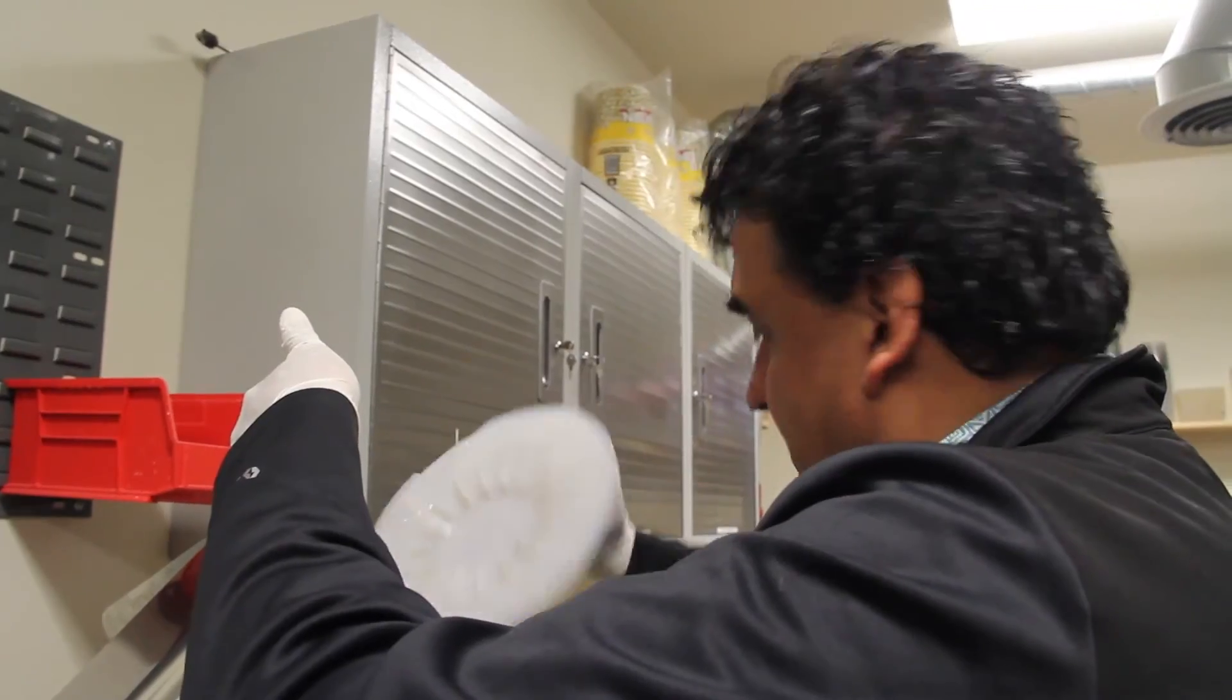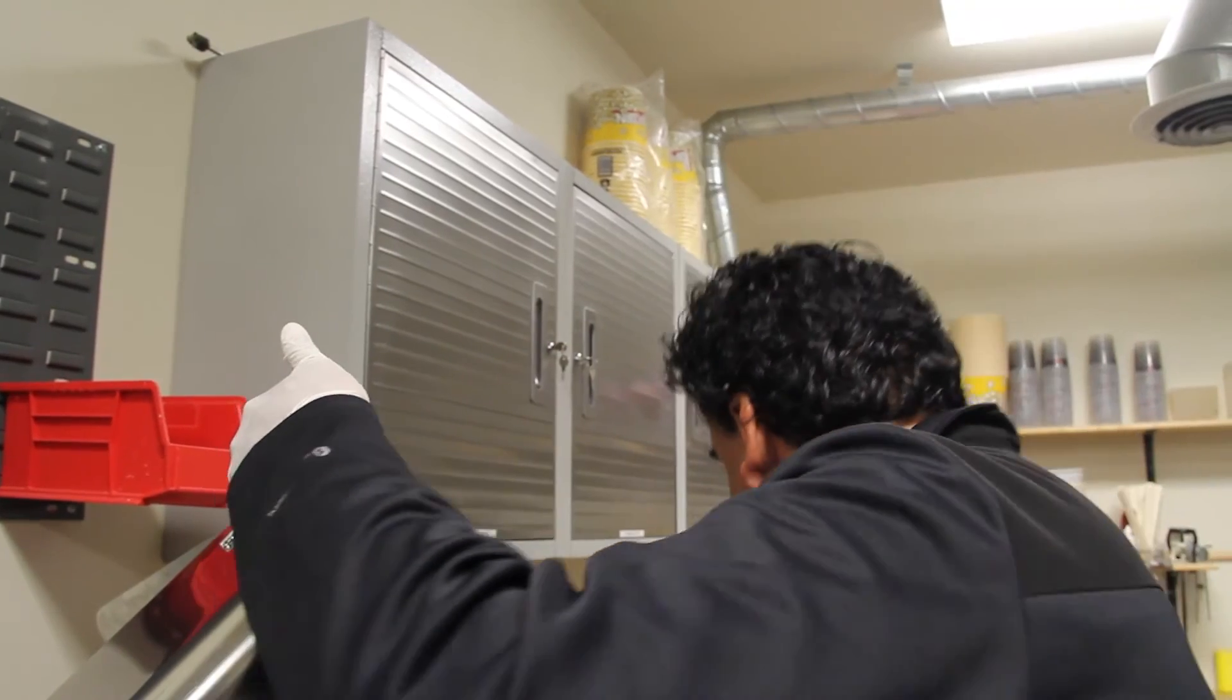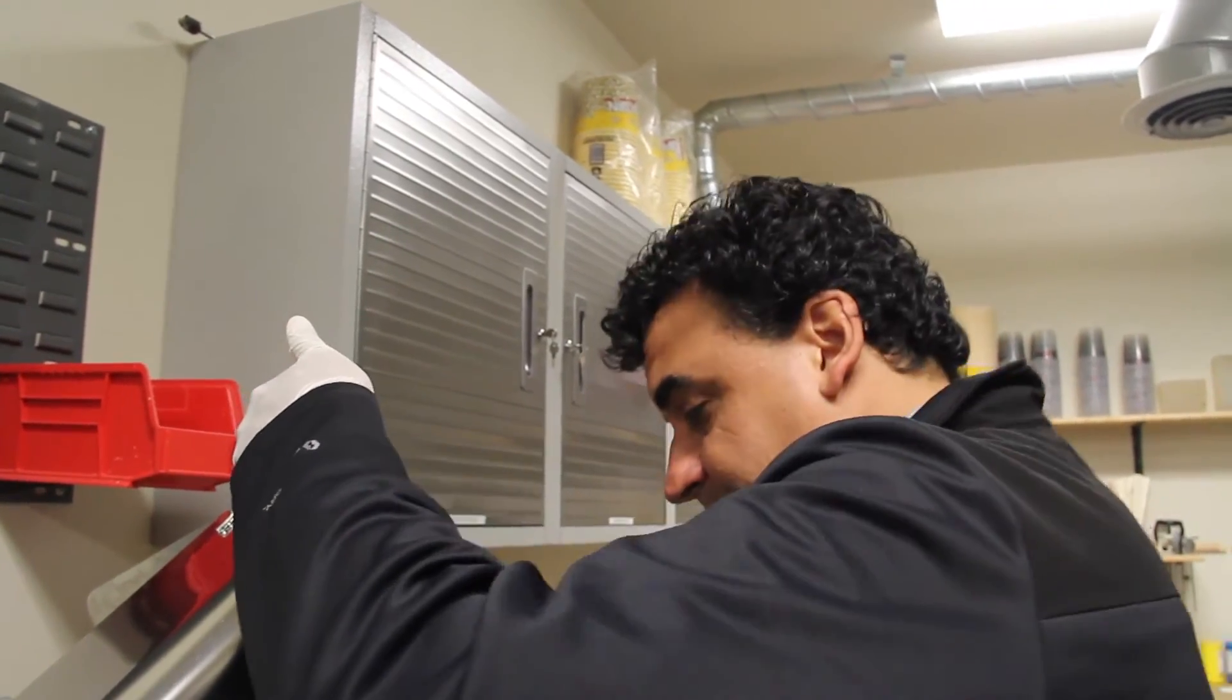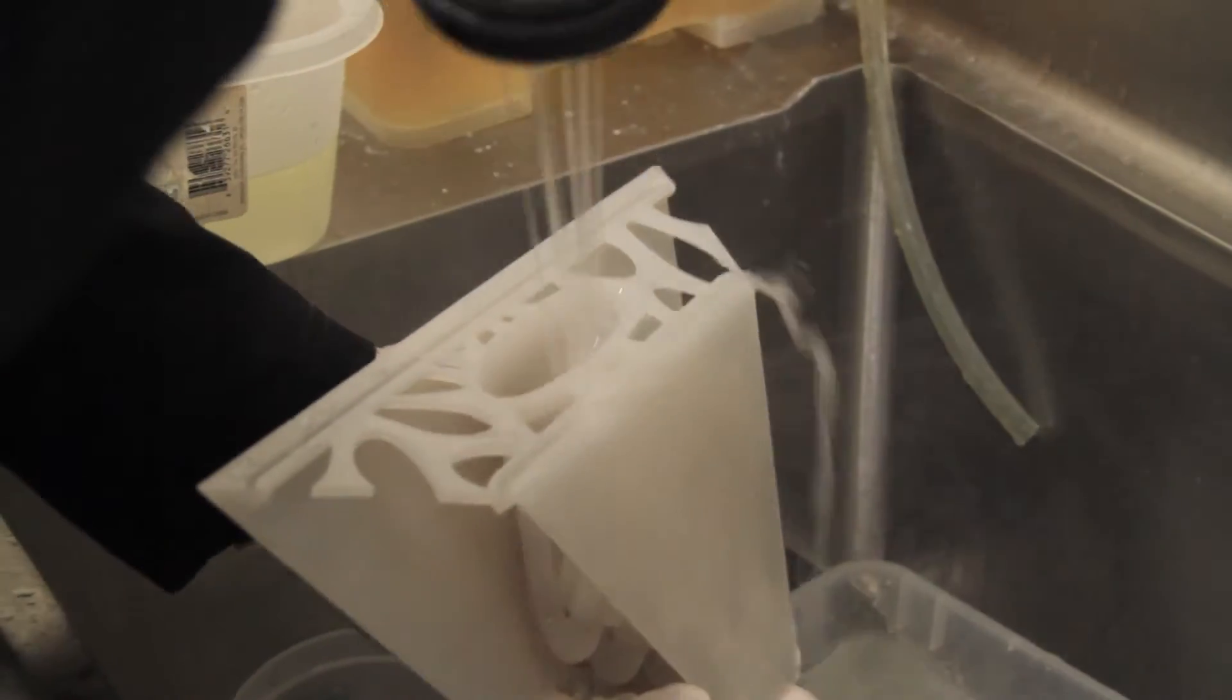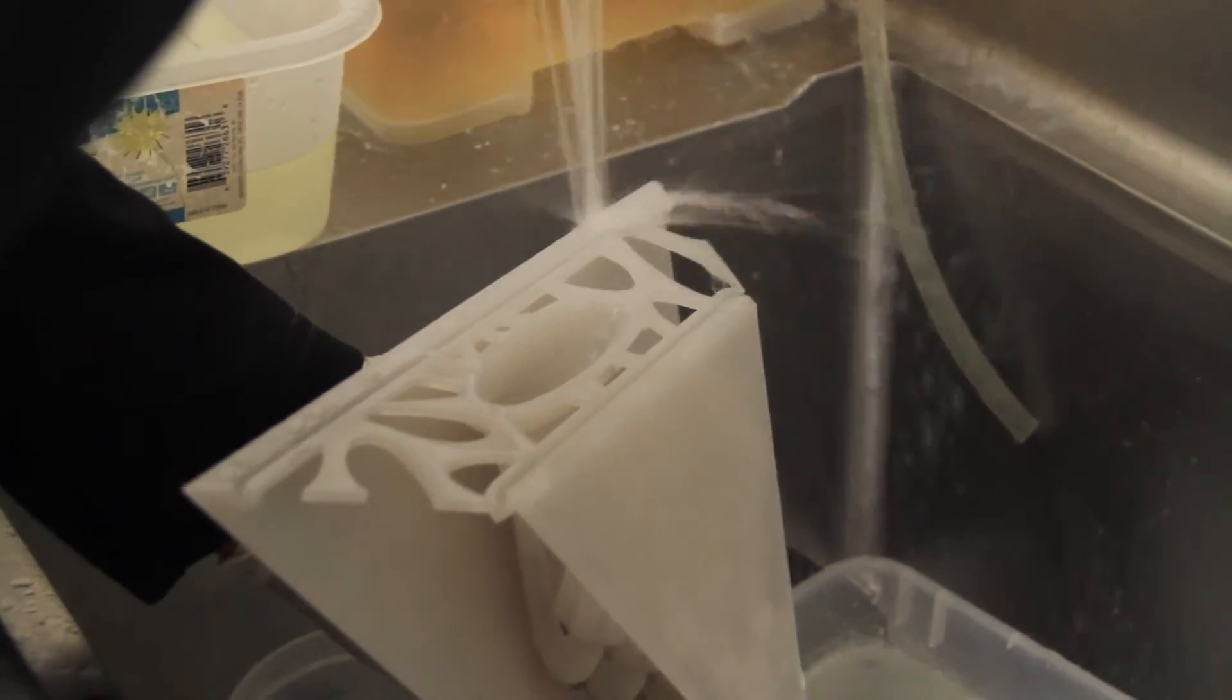The ability to build parts that are arbitrarily complex lets us merge and combine what would be normally distinct pieces, reducing both assembly time and errors.